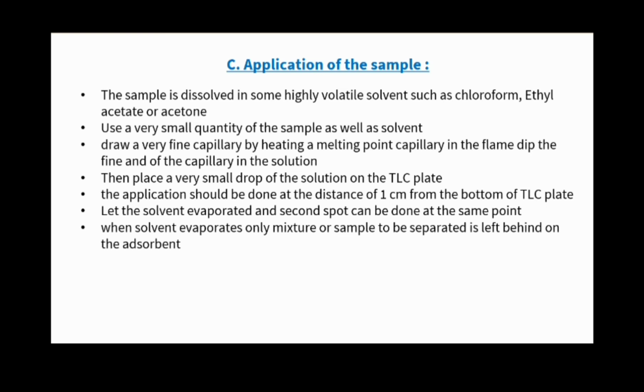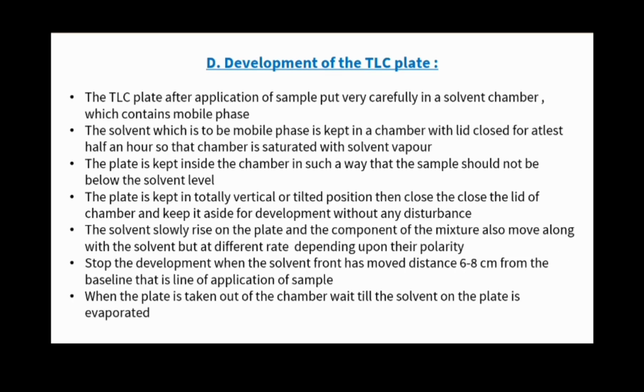After that, the second spot will be put on the TLC plate, and we have to wait again until the solvent evaporates. And when the solvent evaporates, only our mixture which has to be separated is present on our adsorbent. Okay. So the next point is development of the TLC plate.